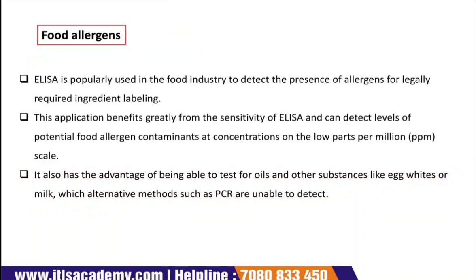Now I'm using the term allergen. So what is an allergen? ELISA is properly used in food industries to detect the presence of allergens for legally required ingredient labeling, as I already told you, according to the FDA.